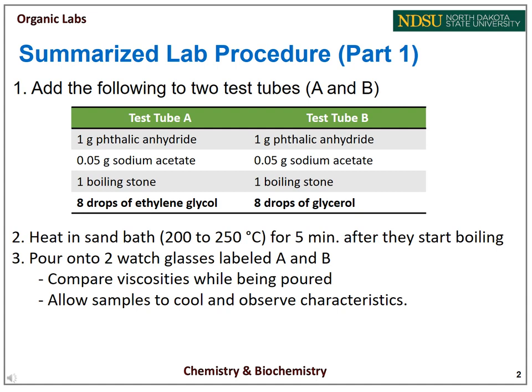After you heat the 2 reaction mixtures, pour them on your watch glass and then compare the viscosities of them as you pour. And then once it's cooled, compare the characteristics of the resulting polymers.